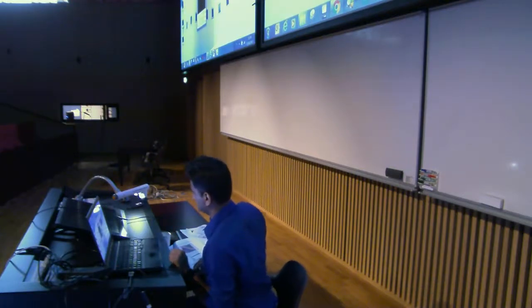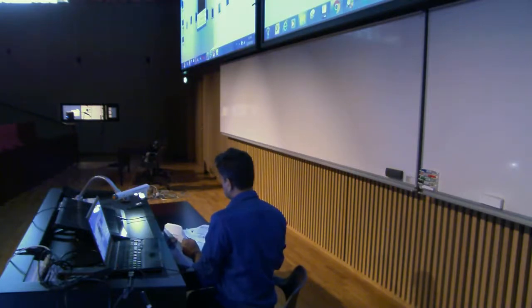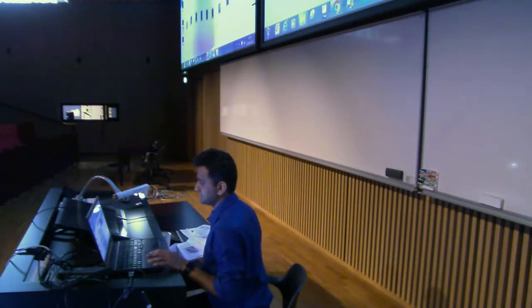Yeah, that's it actually. We haven't covered this extended depth of focus example. So maybe we just have 5 minutes.